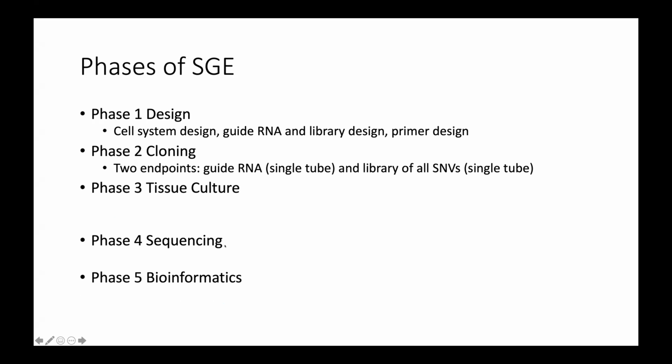For the cloning itself, the guide RNA cloning is not unique to us. It has been reiterated ad nauseum through many of these talks. But the way we clone our library of SNVs is quite fun, and I'll be showing you that.